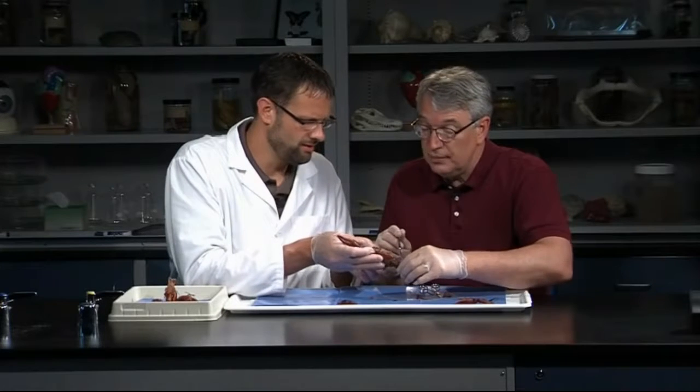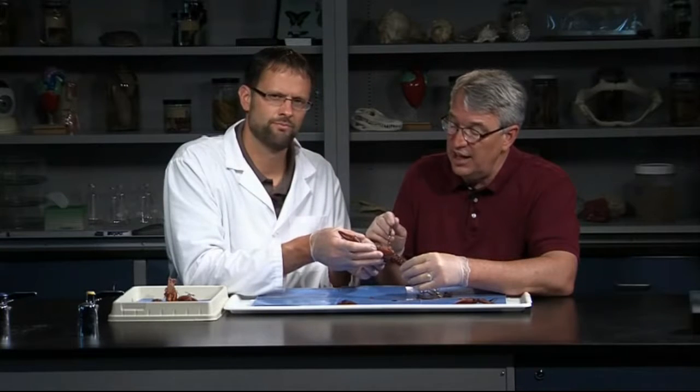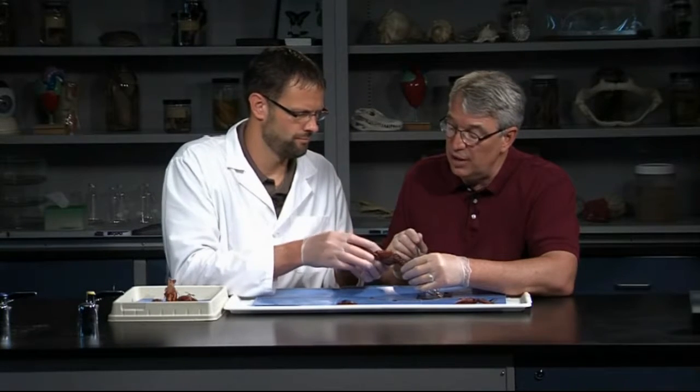Anything else in the main body area? Not too much. They're really pretty simple — a lot of digestive gland and structures there filled that up.